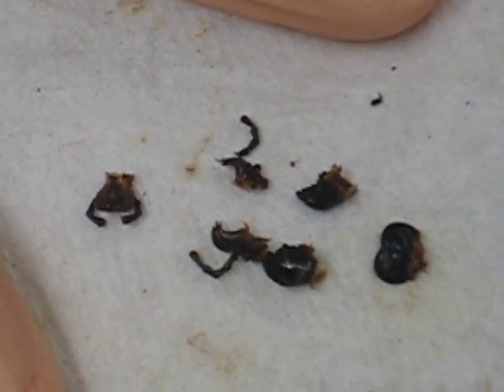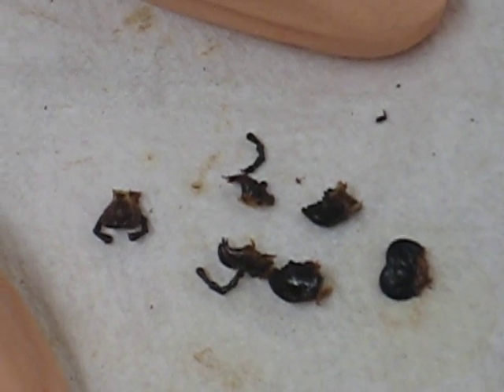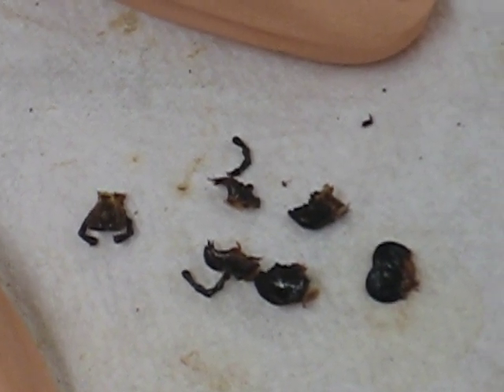So those are the maxillae right there? Yeah, those are the maxillae. So the maxillae — there are two of those and each has a palp. The labium, one with two palps. So the palp just further pulls apart the material? Yeah, manipulates food. You ought to see these things when they're actually eating.